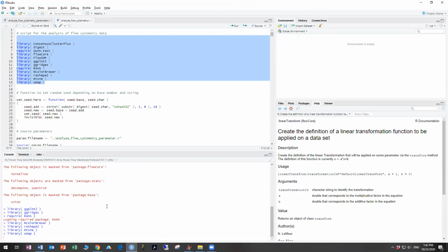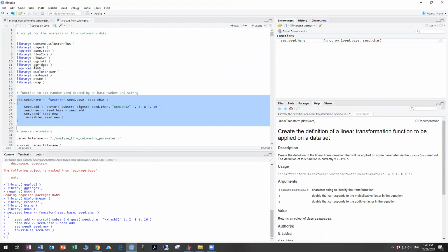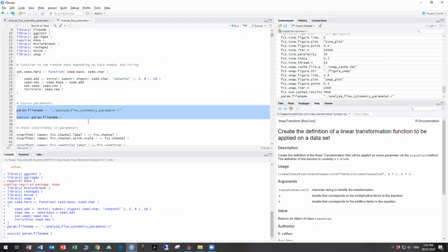Right. So the red text is responses from the computer, and there's no error messages here. It's just talking to us. So that's all worked. Now we're going to go to the next one. That's fine. Next set. It's going to locate your parameter file.